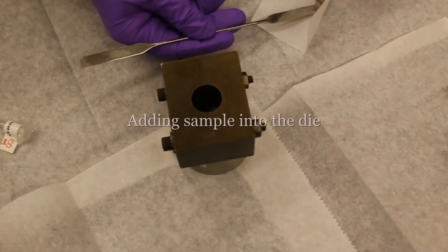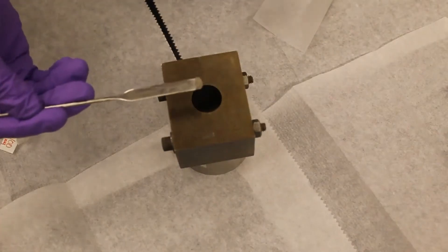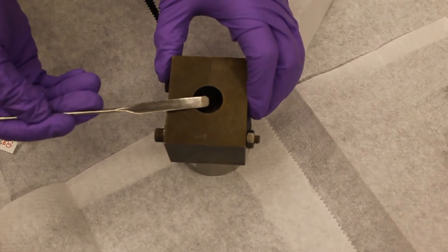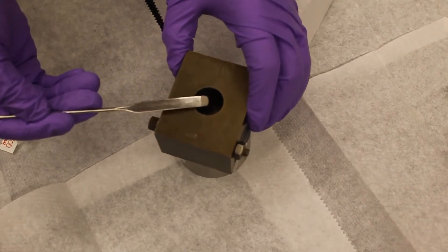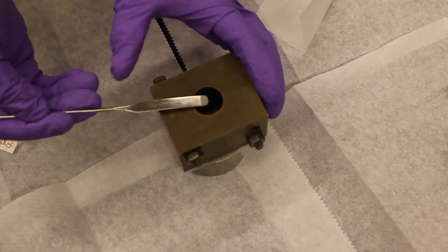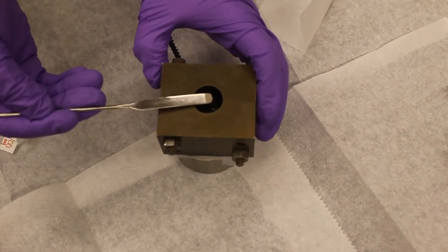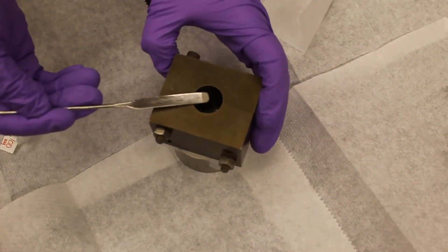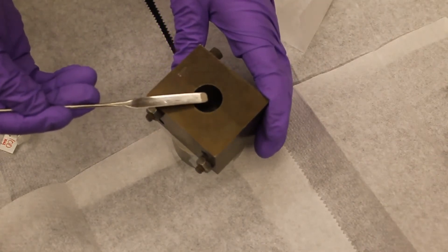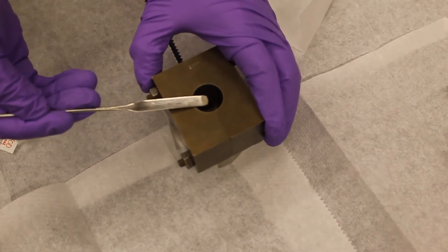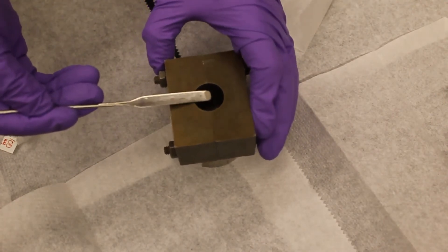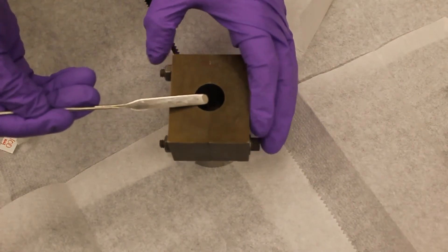Now we're going to put the sample in the die. We do that by slowly pouring the catalyst into the die. It is extremely important that the powder is uniformly spread over the mecha surface, because once this step is completed it is difficult to change the uniformity of the sample. Uniform spreading can be achieved by spinning the die while gradually adding sample.